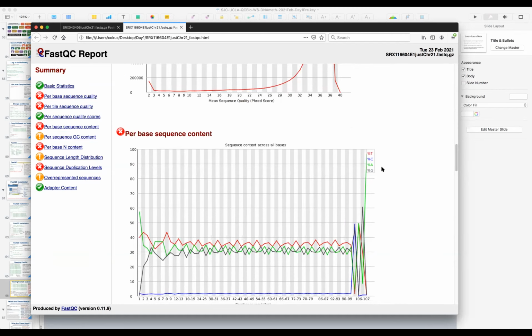So, say you do a big sequencing experiment like this, and you've got, I don't know, 20 samples, and when you're looking through the QC reports, there is that variability. Is the best practice, in order to get as much meaningful data out, to trim away as much of the ends as possible, so that the quality of the reads is high enough, above a threshold score?